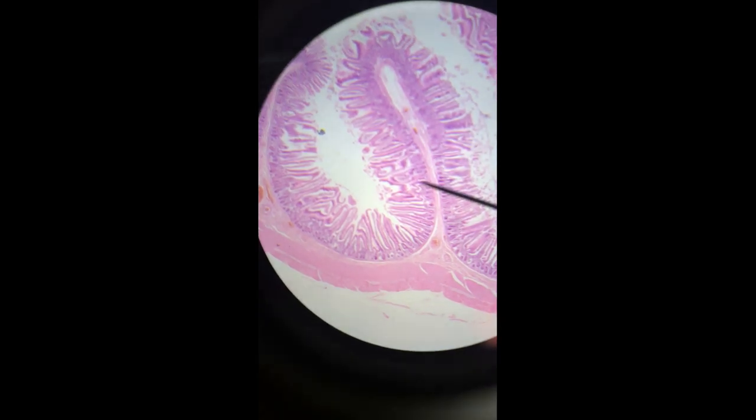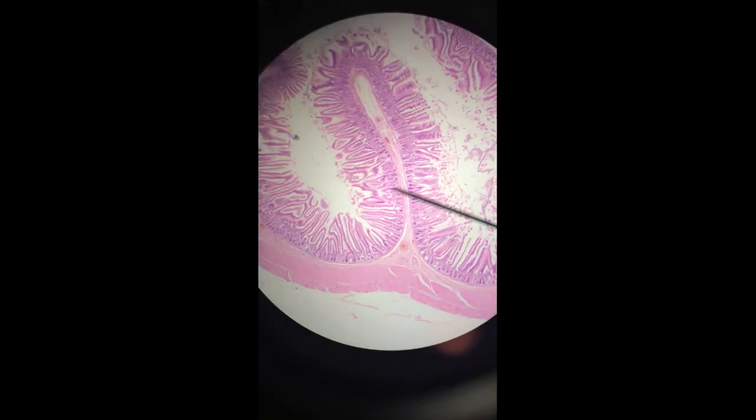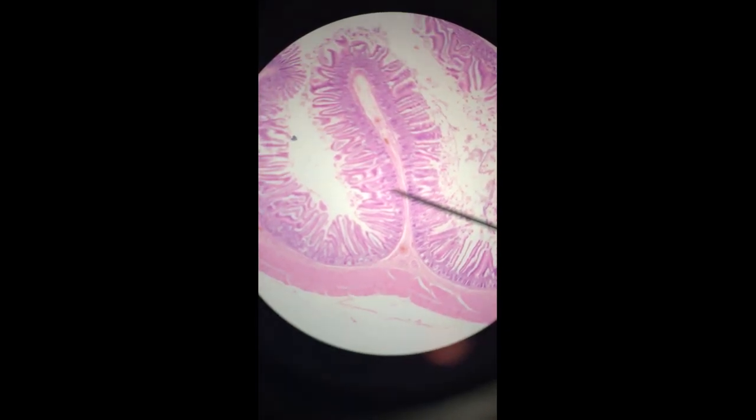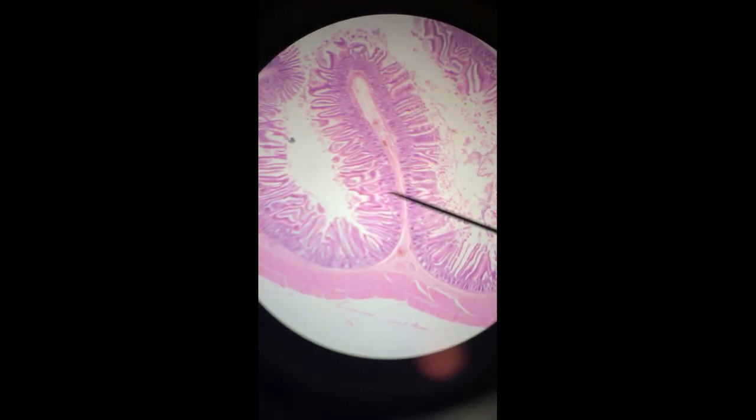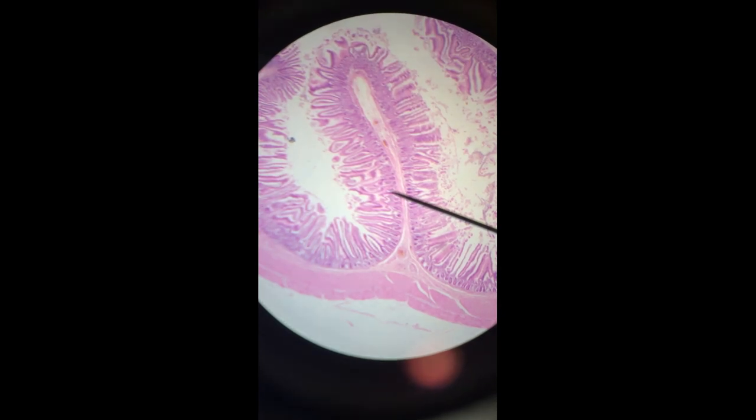People, I just have to tell you how cool the small intestine is. You can see it right here in the microscope. What you can see is the pointer is in the folding of the mucosa, those little intestinal villi that are caused because see that red line right under the pointer?